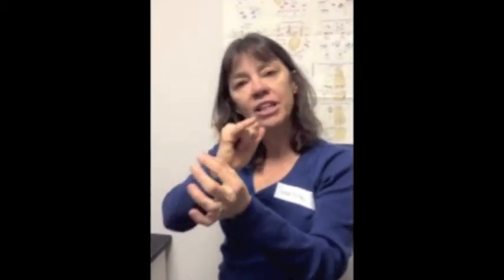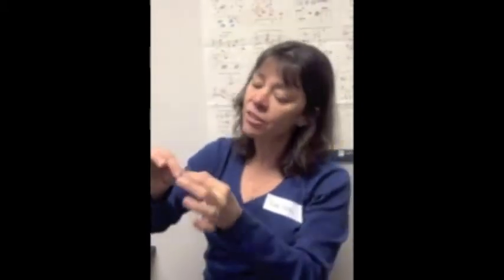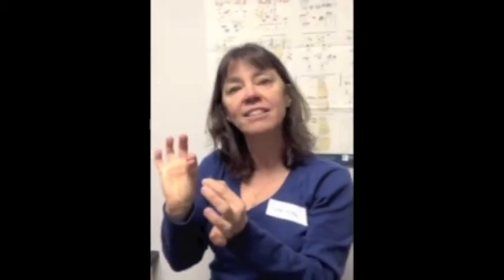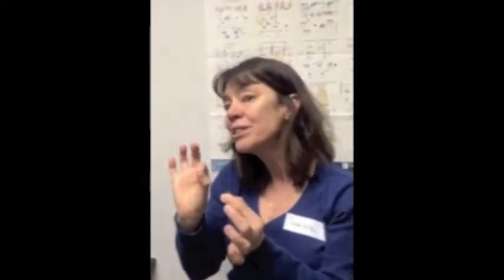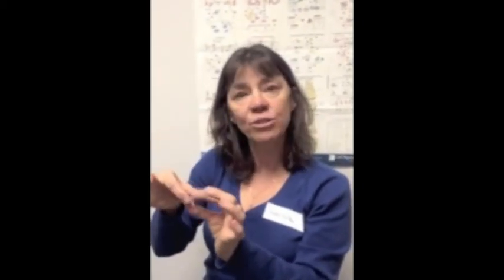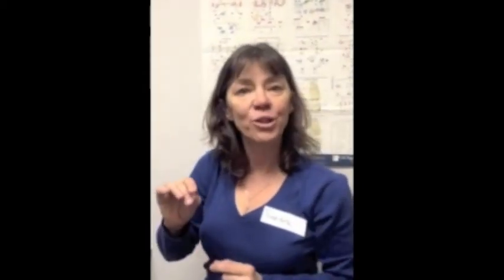So it flows through all this tubing and it comes out the other side, and anything that's in the brain that's small enough to go through that semi-permeable membrane will do so. It crosses down its concentration gradient, it can come out the other side, and we can collect those tiny samples with very tiny bits of neurotransmitters in them and run the HPLC to assess the levels of neurotransmitters.